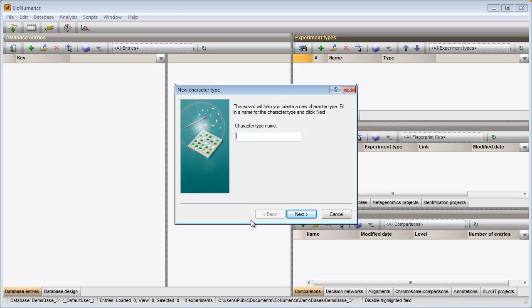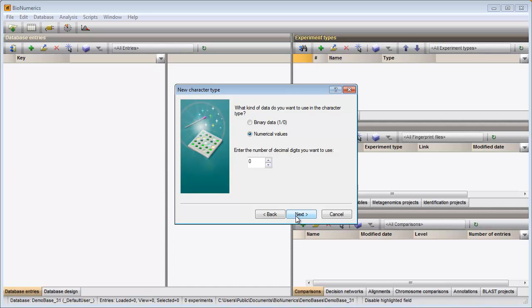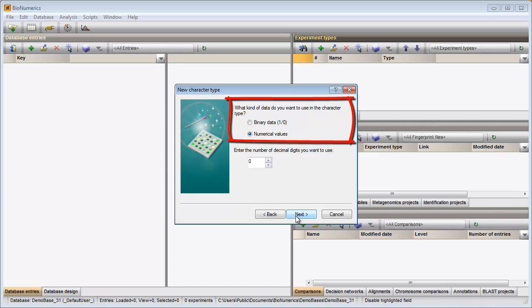In the first step I need to specify the name. In the second step I need to specify the type of data I will store in my experiment. I will import numerical values so I can leave the default option checked.